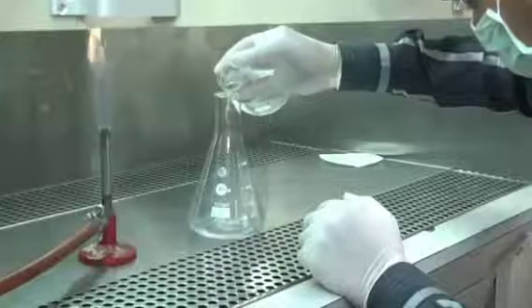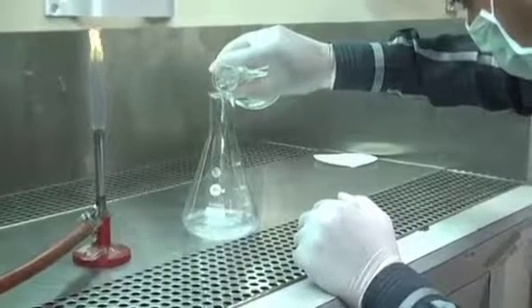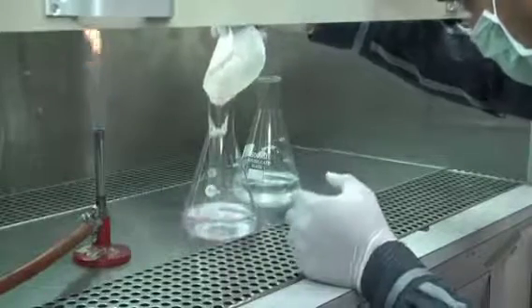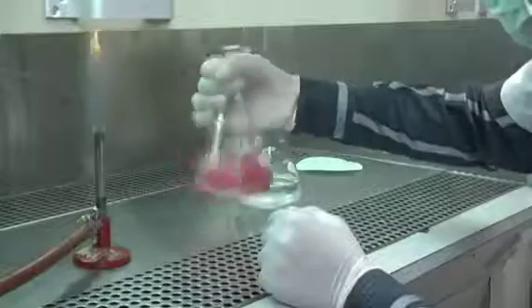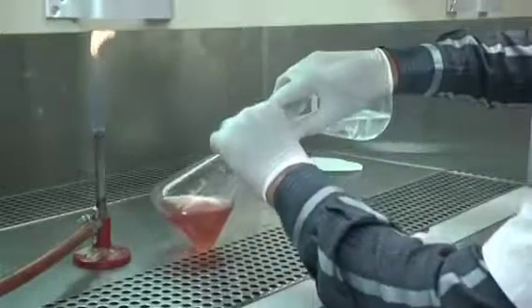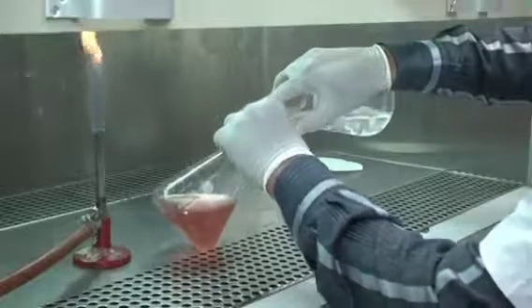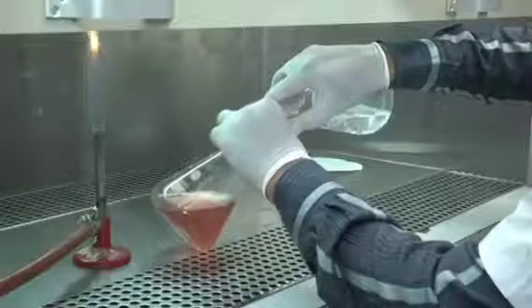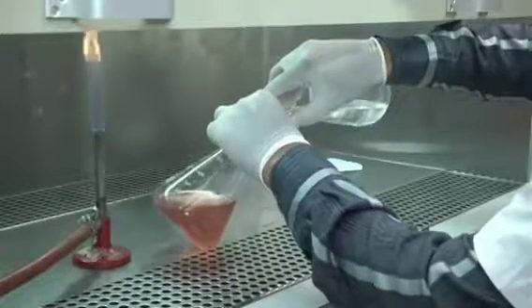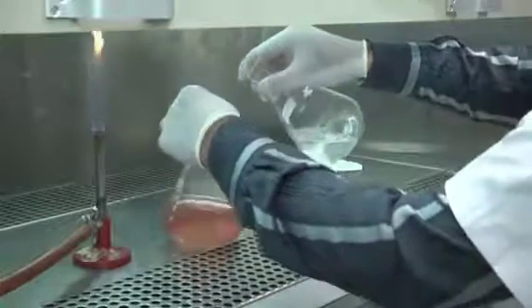Pour half the required volume of distilled water in the vessel, then add the weighed quantity of medium, mixing briskly for a few minutes. Pour the rest of the distilled water down the sides of the vessel to wash away any medium sticking to the sides of the vessel back into the solution.